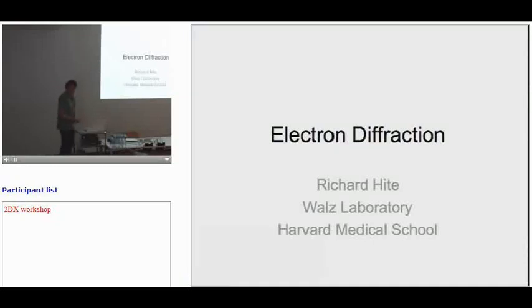Hi, I'm a graduate student in Tom's group, and I spend most of my time collecting electron diffraction patterns of aquaporin crystals. And aquaporin crystals are quite nice, as you've heard time and time again during this lecture. They're really nice to learn how to collect diffraction patterns on, because they diffract very well. Unlike most crystals, where you spend years and years trying to get decent crystals that you can actually collect, once you get to that point, it's time to leave or someone else will take over. But for me, I had nice crystals to work with.